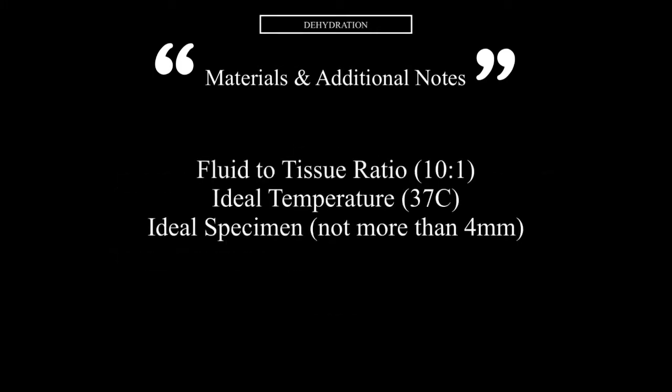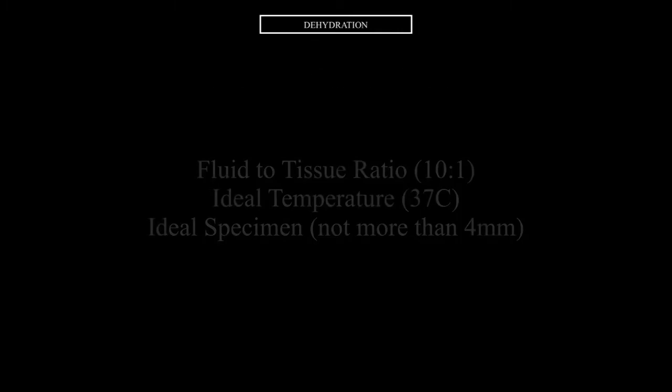More importantly, to ensure that you are procuring the best results, you would need to take note of the following. The fluid to tissue ratio should be 10:1, the ideal temperature should be 37 degrees Celsius, and the specimen should not be more than 4 mm thick.